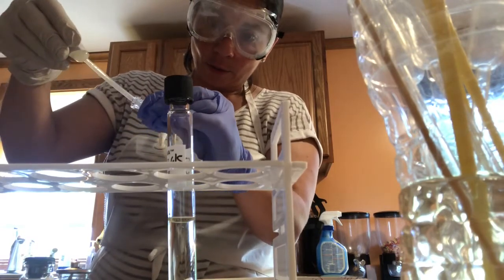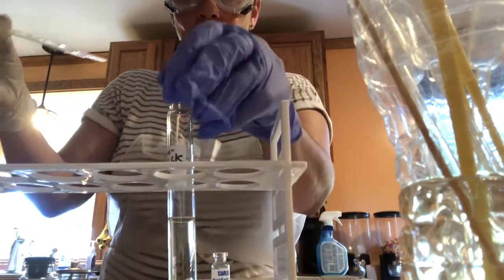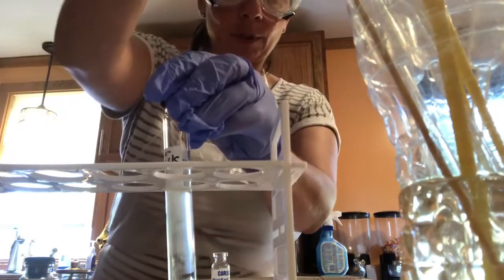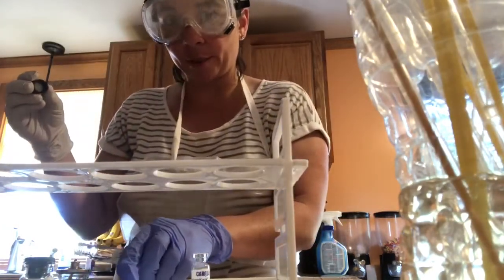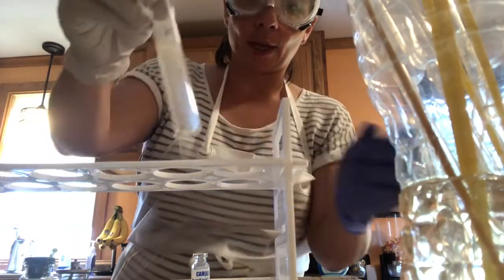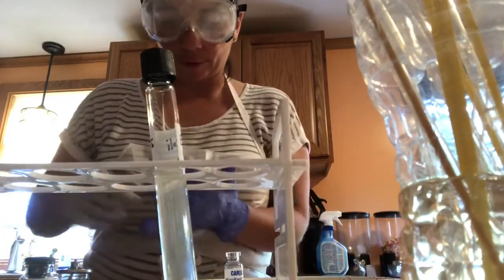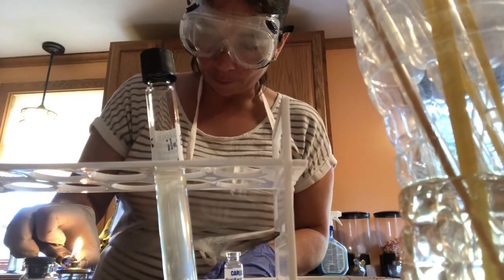Gonna suck it all back up into the transfer pipette. Gonna open this up and put it back in here. Okay, I'm gonna put this in my disposal container and then take this and just flame the mouth of it, so that it's sterile or somewhat sterilized. Leave the lid just a notch open and set it back there. Now my flame went out, so I'm gonna try to get that going again.